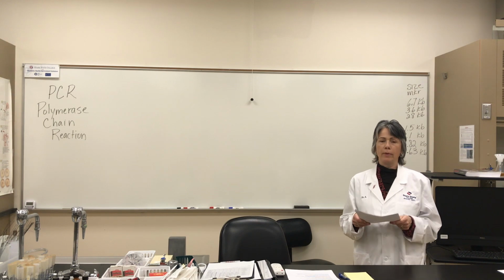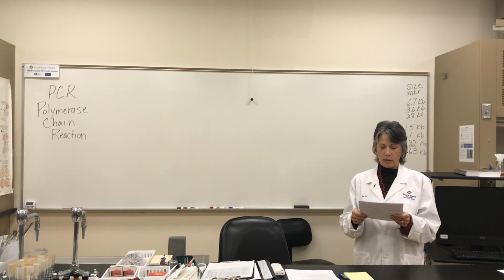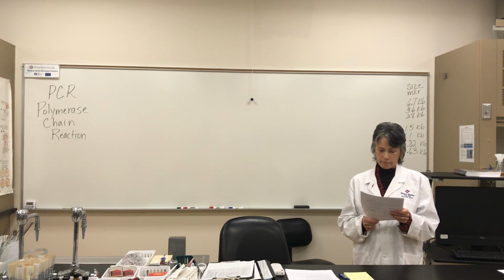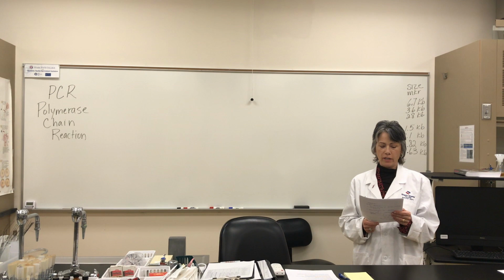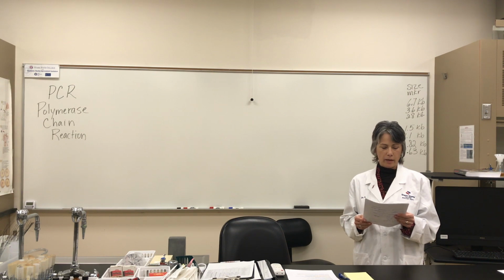But this experiment is about trying to determine the source of it. To determine the source, any of the hospital workers that have had contact with the affected patients are being tested. So we are going to be testing simulated DNA from fecal samples. Isn't that nice? From the hospital workers. You're not going to be dealing with any simulated fecal samples, just simulated DNA.